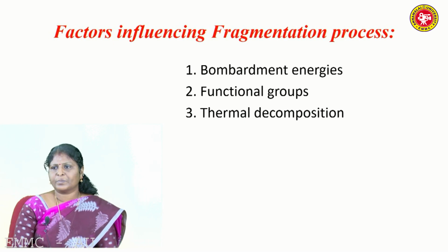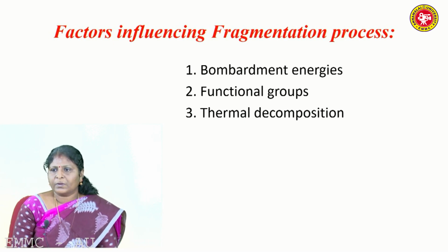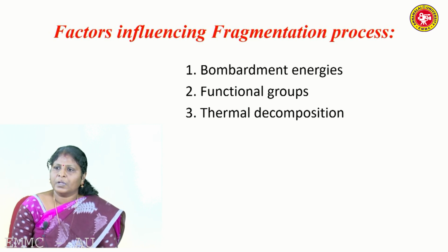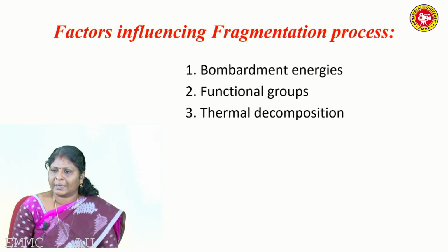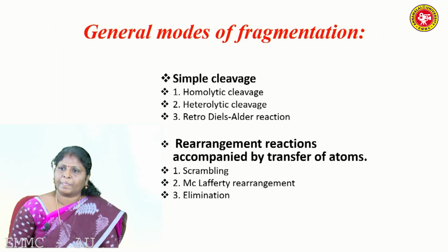Factors influencing the fragmentation process. Number one, bombardment energy. What is the energy we are giving to that molecule? If the energy is less, the fragmentation is slowed down. Number two, functional group. Depending upon the nature of the functional group present in the system, the fragmentation is affected. Next, if the molecule is stable enough, fragmentation is very rare. But if it is thermally labile, then decomposition of the molecule may occur.